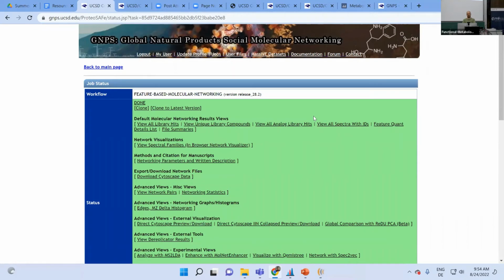But when we tested a bunch of different data sets with the PASSATUTTO tool, we saw that typically an FDR of about 5% was around 0.7. And also just from working with this data for a long time, that seems like a reasonable cutoff. Obviously, depending on your data set, that FDR goes up and down, right? There was variance. For some, the 5% FDR level was lower, for others, it was higher. That also depends a little bit on your instrument and on the complexity and quality of the spectra you have.